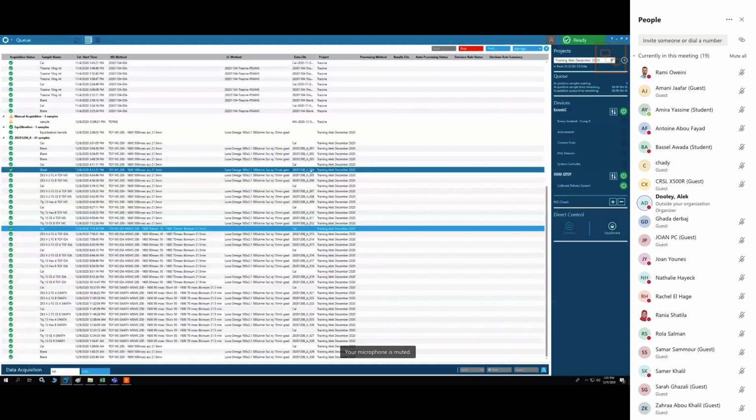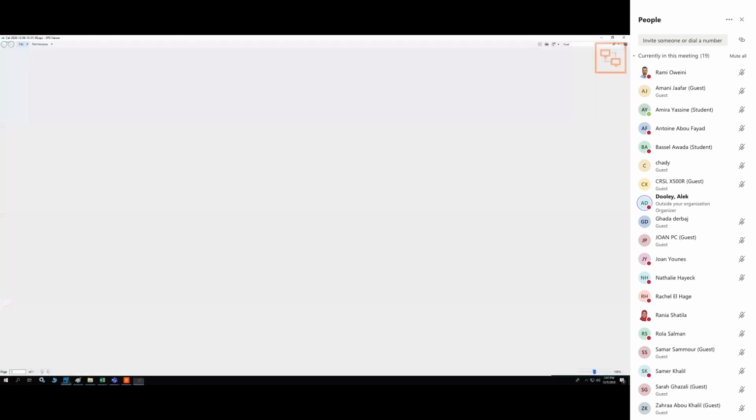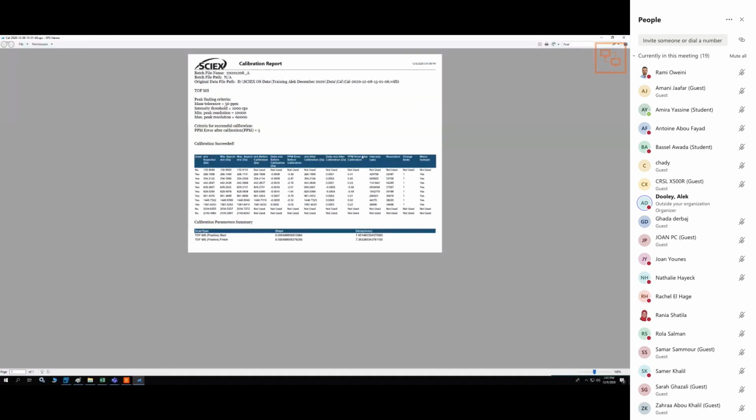I think there was a second question that was overlapping. My question was, if we do the quick MS tuning before going to the batch, will the numbers from the calibration be better? I don't think it will. Just to clarify, the number that I'm really concerned about is after. It's this number here. I don't think it will improve this number. As you saw, in every case this number is okay.